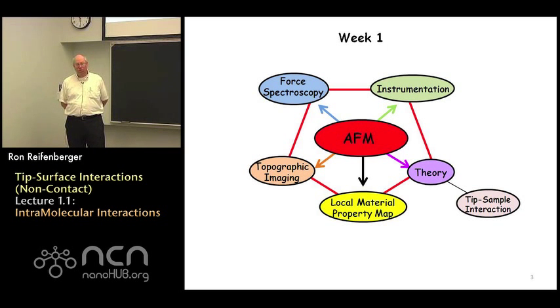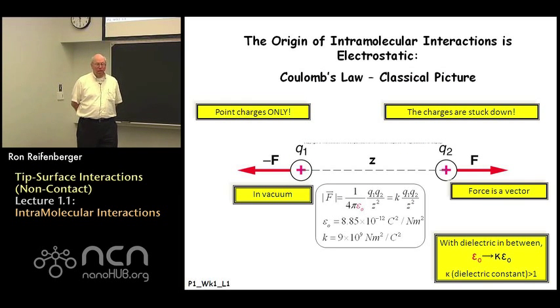What I'd like to do now is just emphasize to you that for week 1 of the course, we're really going to focus on tip sample interactions. And in particular, we're going to focus on the interactions between individual atoms and molecules, one with respect to another. We're going to try to sort out how those interactions vary as a function of the separation between the various atoms and molecules. So this forms a very basic, fundamental discussion that nicely lays the way to calculations of tip sample interaction forces, which is, of course, what atomic force microscopy really measures.